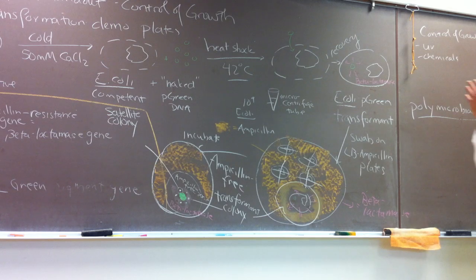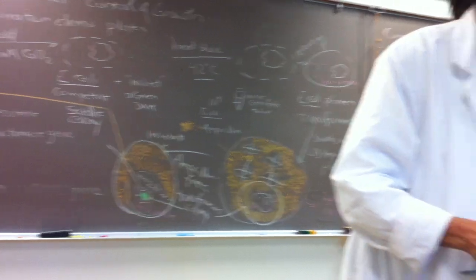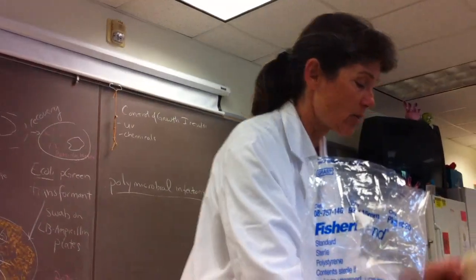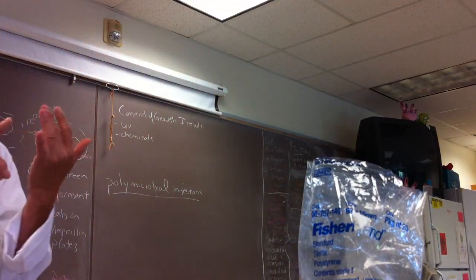Okay, guys, the point here is that I really would recommend that before you leave today, you come up and look at these gorgeous transformation plates. Very important. Okay, here are quiz questions, you guys.